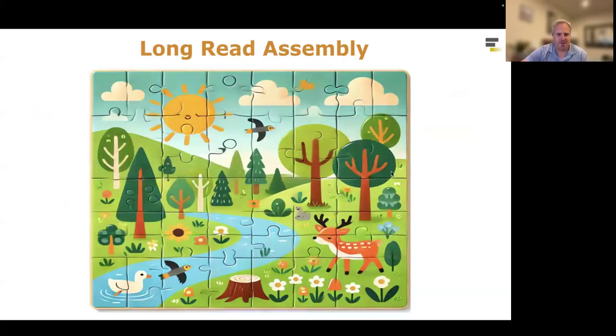By analogy, genome assembly is often thought of as a jigsaw puzzle that you need to assemble. With long read sequencing, the pieces are much bigger, which means you'll need many fewer of them. And thanks to, say, HiFi sequencing, those pieces are very accurate. So you get a crystal clear picture just using long read sequencing. It's highly recommended for basically any species now if you need to do de novo assembly.